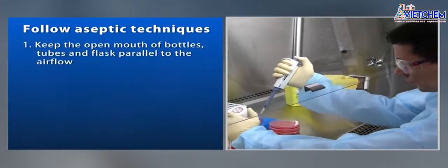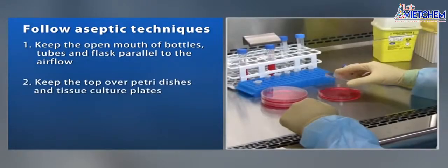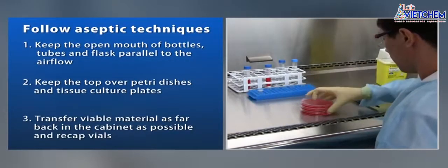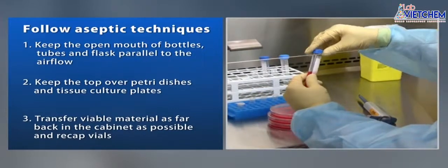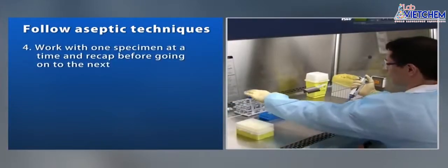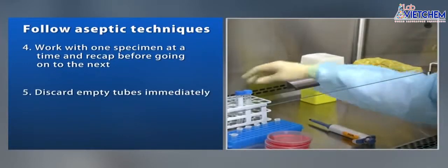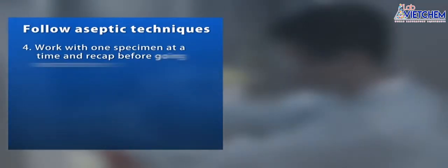It's essential that proper aseptic techniques be followed. Keep the top over Petri dishes or tissue culture plates. Transfer viable material as far back in the cabinet as possible at work zone and always recap vials. Work with one specimen at a time and recap before going on to the next. Discard empty tubes immediately. This will minimize contamination of your work.